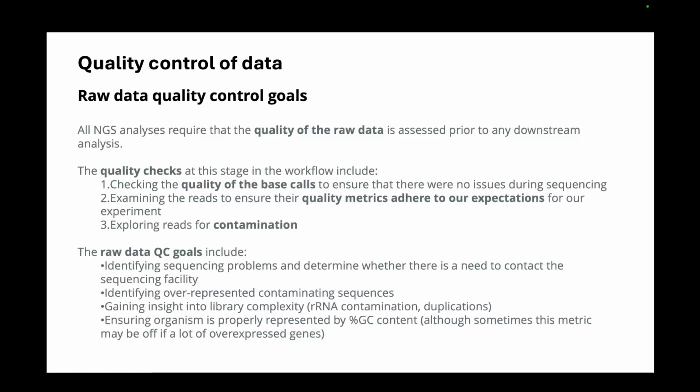Okay, then moving on. Now we have the data. We saw how data is generated from your sequencing machines, and how they are base calling. Now you have the raw data, in FASTQ or whatever format you put it in. Now you have to do certain quality control on the raw data, because obviously there will be some errors associated with it.